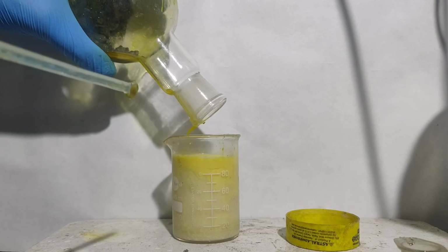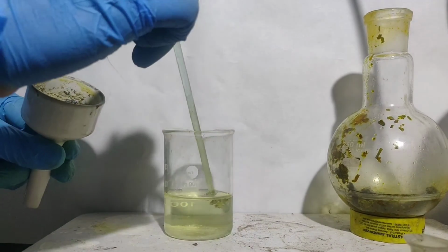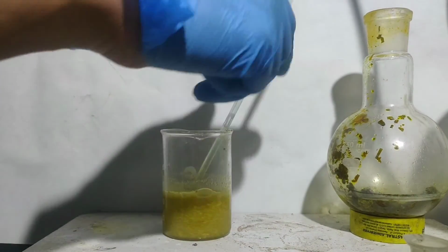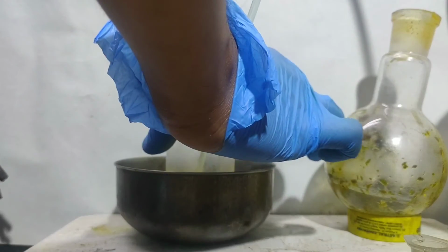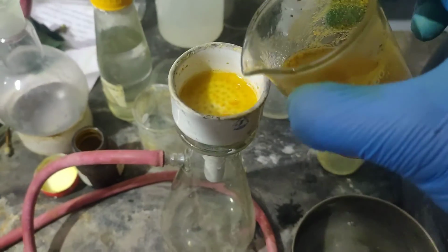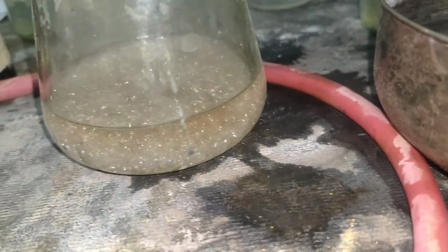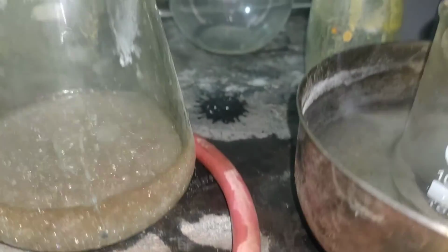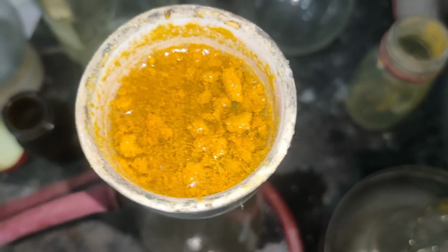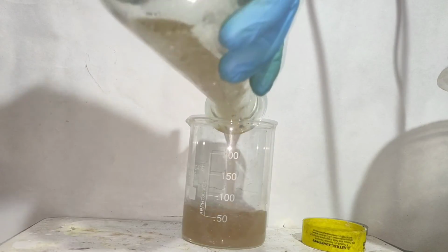Then the precipitate was vacuum filtered and mixed with dilute HCl and then placed on a hot water bath for 15 to 30 minutes. The residue was filtered off while hot. In the filtrate, crystals of benzidine dihydrochloride were formed. The residue was washed with distilled water and the filtrate was transferred into a beaker.